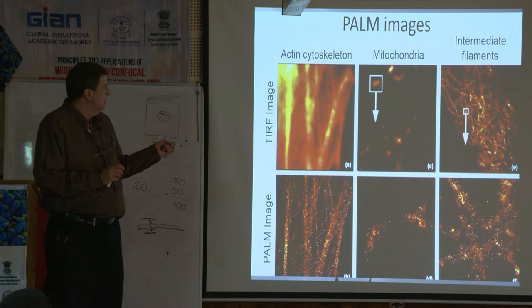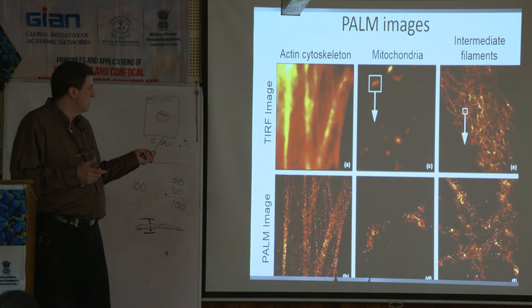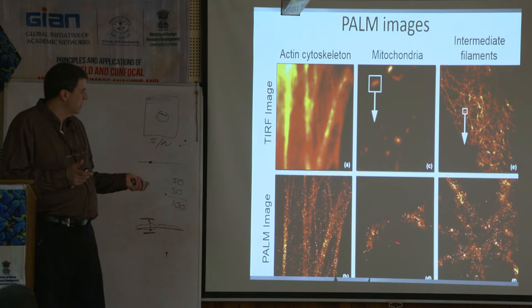But anyway, PALM, just showing one of the other techniques, pretty similar to STORM. I mean, they're all in that same kind of idea. But you can see, again, the resolution just gets dramatically increased by building up the dots.